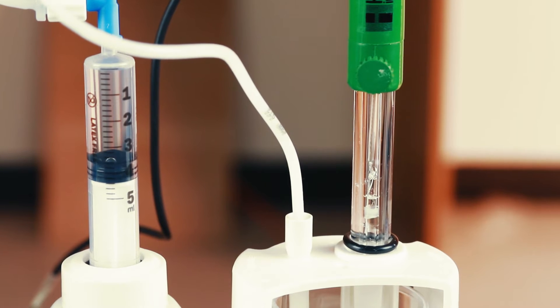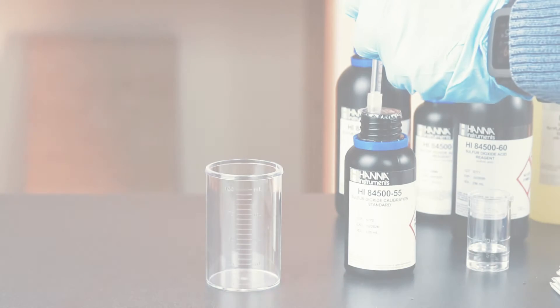Before we take measurements, we suggest daily calibration for best results. This simple two-minute process helps you ensure accurate results. Here's how we do it.